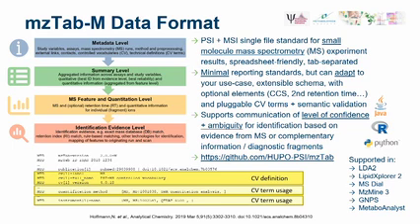And at the top level, on the summary level, this is your typical report table that you would submit, for example, as supplementary information for your publication, containing all of your identified metabolites across your different assays, with the final quantities assigned, and identities linking back to, for example, external databases. This is then supplemented by the MS feature and quantitation level, which actually contains the raw information from your extracted mass spectra. And then finally, the identification evidence level, which allows you to express identification information from database hits, for example, or other kinds of identification methods.